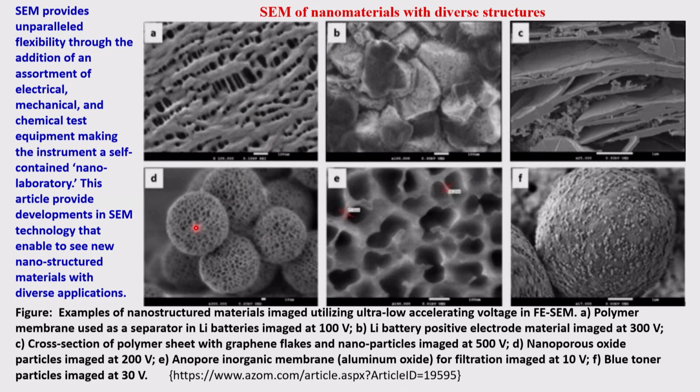So you can study their pore size, their topology, surface structures, and shapes. Also you can determine the geometries of these. So many of these things. You can also identify some chemical species, not shown in this particular set of experiments, but you can do other things as well, like identifying the distribution of the species, atoms, or other things which are present in that particular kind of sample.